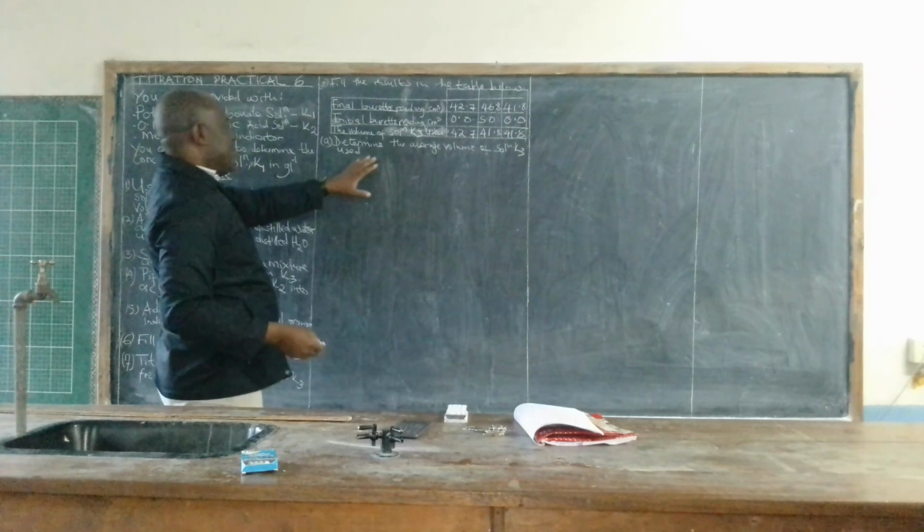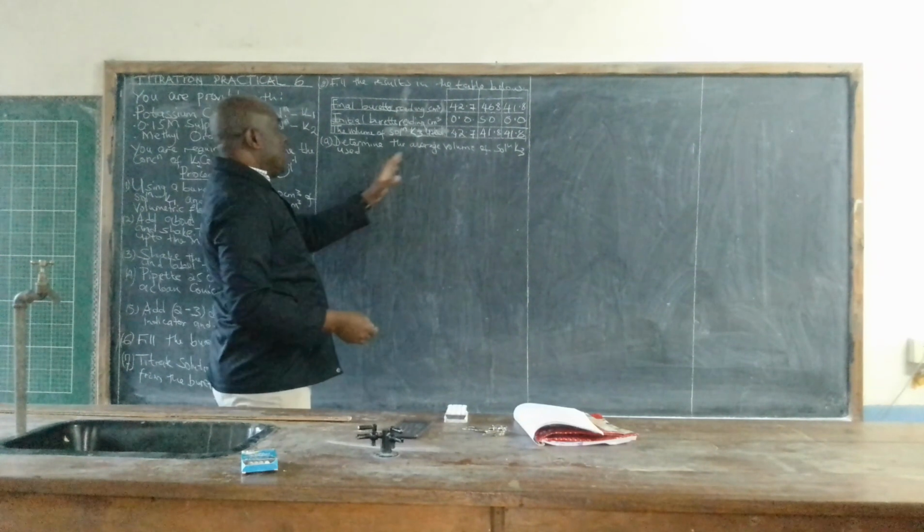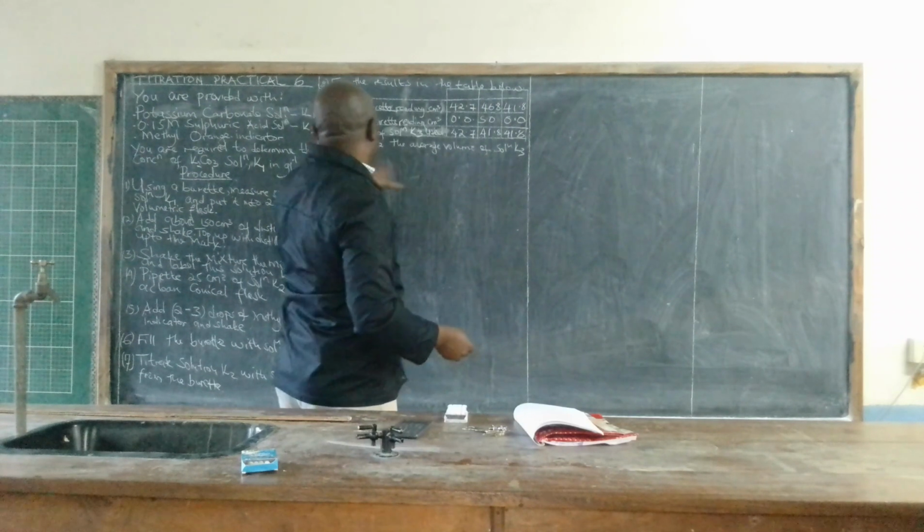So the question here is requiring us to determine the volume of solution K3 used.